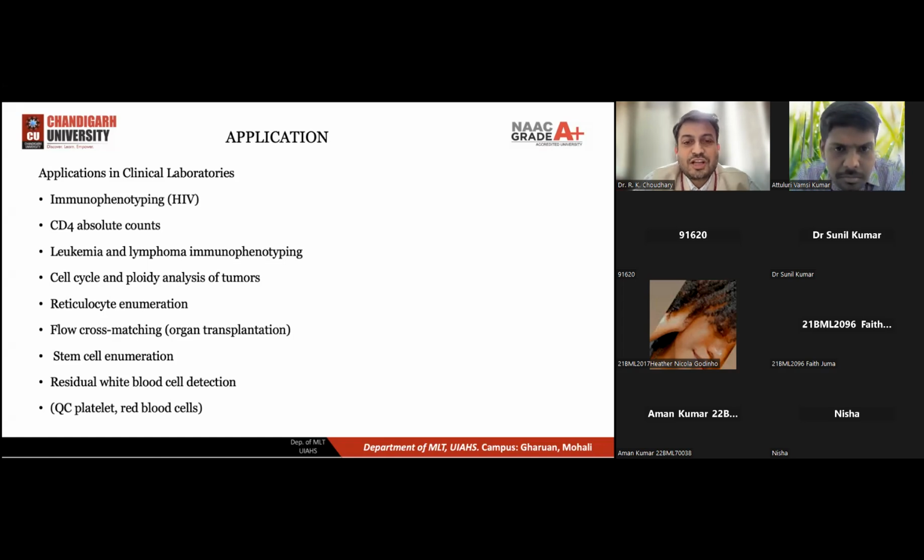Okay. So phenotyping is the same as genotyping, where you analyze the gene or the chromosome or genetic area. In phenotyping, we analyze the cell surface, or cellular level, internal or external. So when we discuss immunophenotyping, that means antigen, antibody or anything present on the cell surface.